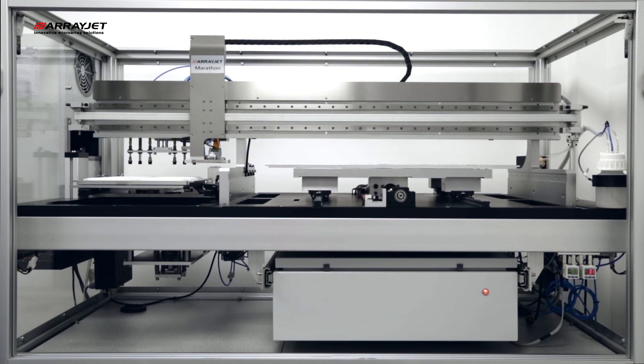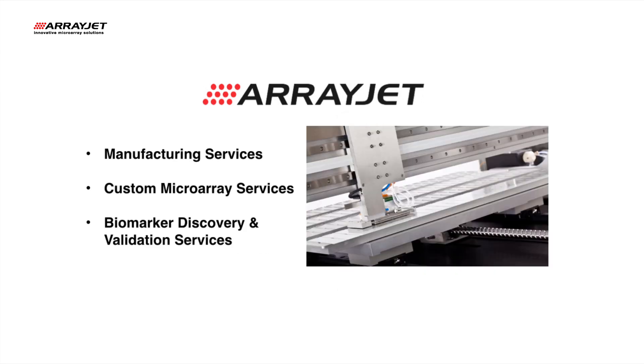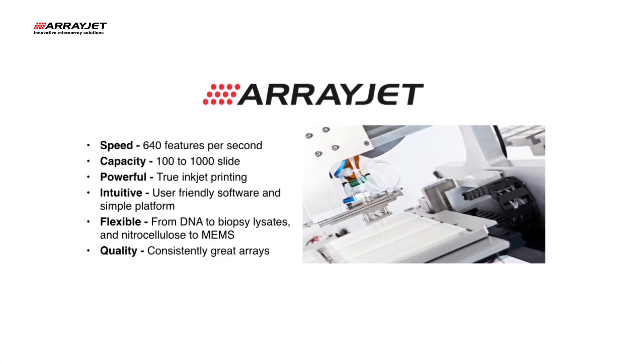ArrayJet offers five scalable microarray printing instruments and ArrayJet Advance, our in-house microarray printing service. We also offer accessories and consumables to support both our instrument and outsourcing requirements.